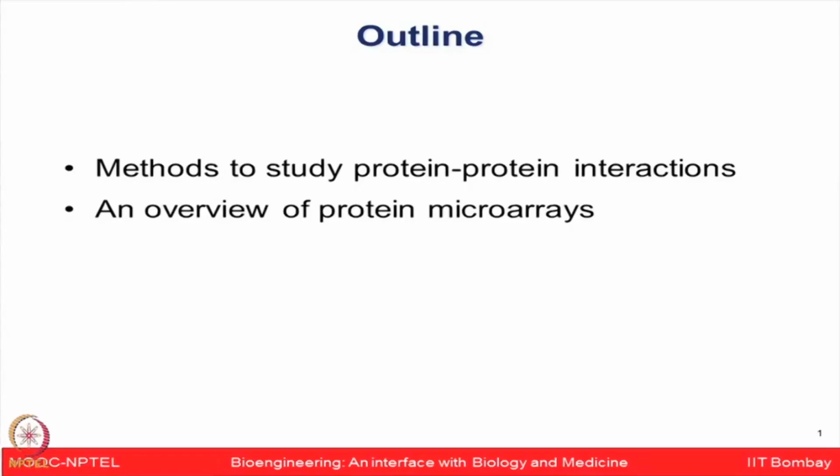Hello everyone. Today I am going to discuss the finer facets of functional proteomics and how it can be deciphered using advanced protein microarray platforms. First, we are going to talk about methods to study protein-protein interactions, and then I am going to provide you an overview of protein microarray platforms, how they can be used to study various interactions, and other applications.